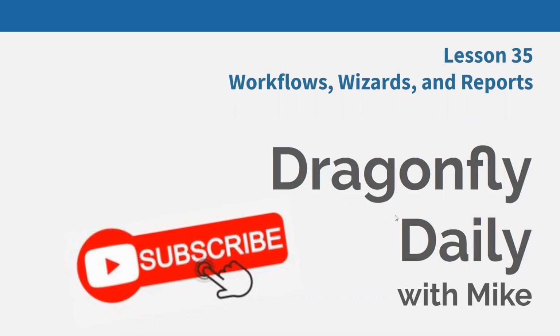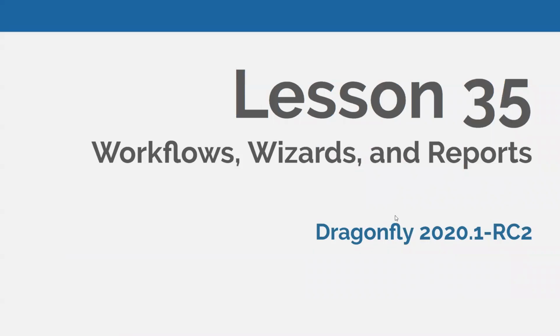Now, today's lesson: workflows, wizards, and reports. We will be using Dragonfly 2020.1 Release Candidate 2, and that is available now. Or if you're watching this video in the future, then you could just use the production release of Dragonfly 2020.1 or subsequent releases.